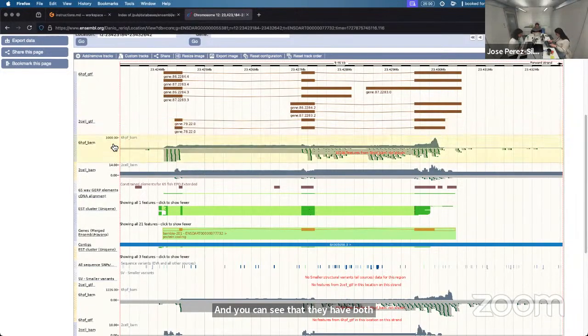You have to pay a bit of attention, but you can see next to the name is the scale, and if you look at that, you will realize how much more remarkably different they are than you probably thought initially, as this is on a scale of 0 to 1,000, meaning that this is probably close to 1,000, while this is on a scale of 0 to 14, meaning that this peak here might be 14.